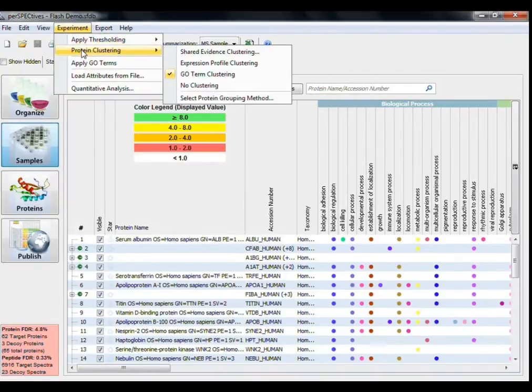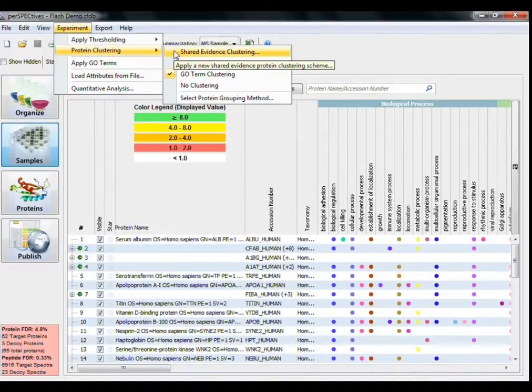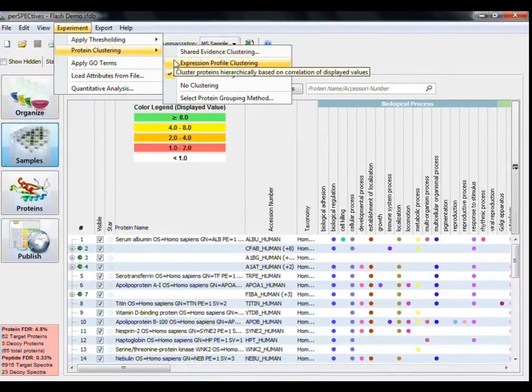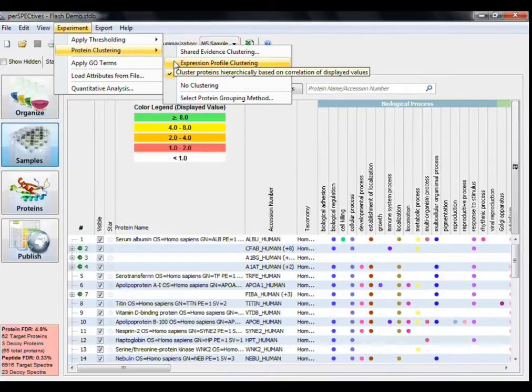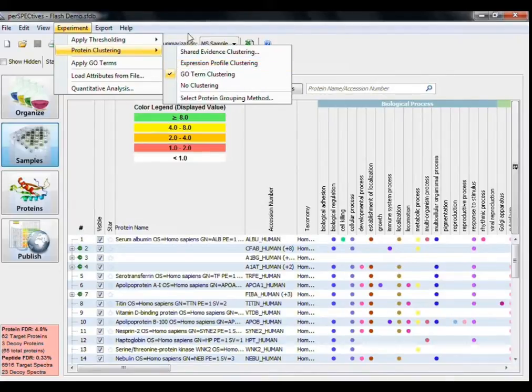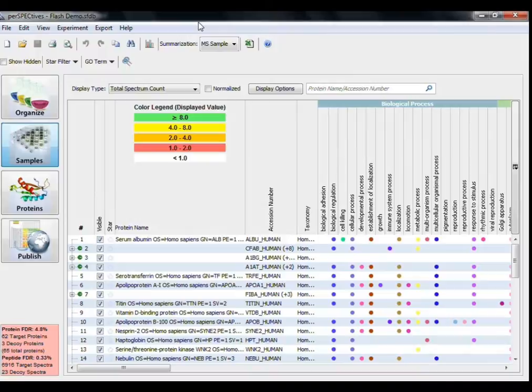Under the Protein Clustering menu option, you can also select Shared Evidence Clustering, which is Scaffold's method of clustering, and Expression Profile Clustering, which groups proteins into clusters based on their differential expression behavior across all samples.